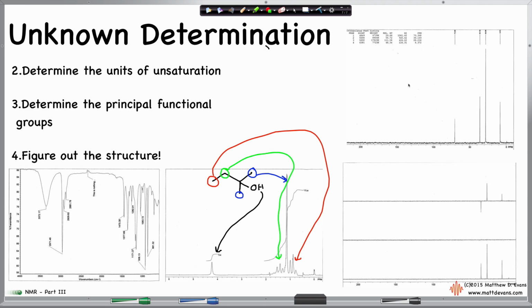Let's draw this molecule here, like so. For each type of carbon, you're going to do the same thing. Let's start with the carbon here, which is that signal. These methyl groups right here are, I believe, the bigger of the 2 peaks.